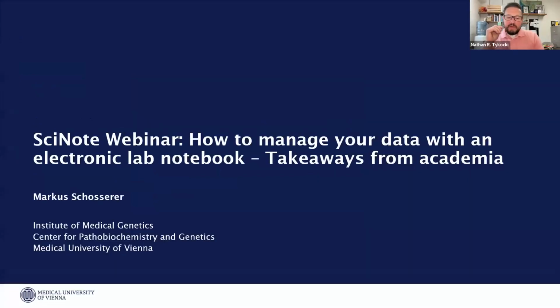Yeah, so we decided to switch when I started my lab. I come from a lab of just me at the University of Vermont. After I was a postdoc, I was a research assistant professor, and it was all paper. And then I realized when moving, that became really complicated, of what data go where, being able to track these things. And also, I'm really, really poor at keeping a good written lab notebook and always have been. I hate to admit that, but it's true. And so this was a way that kind of fit within my tech abilities, because I like techie things, but also centralized everyone in the lab to be able to do that.